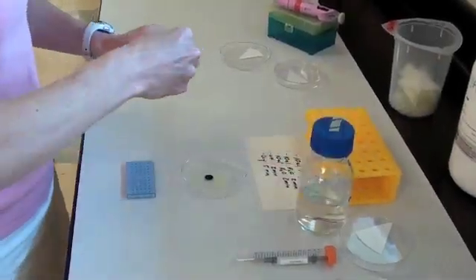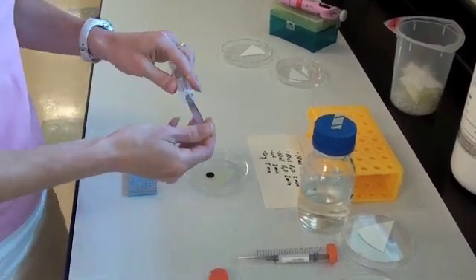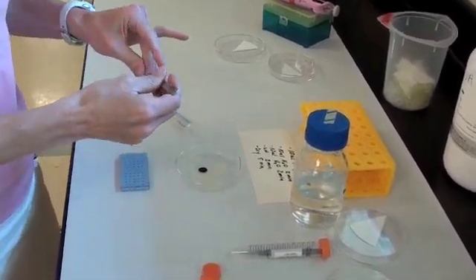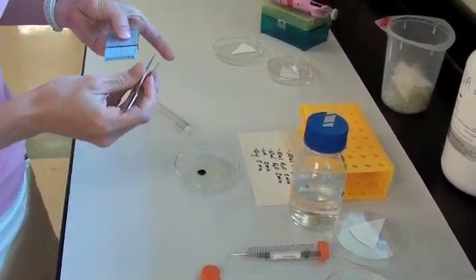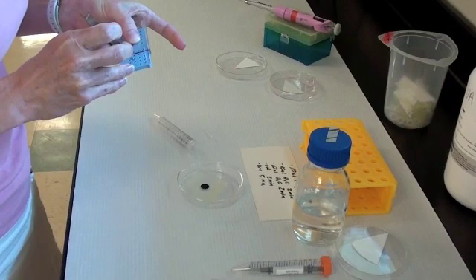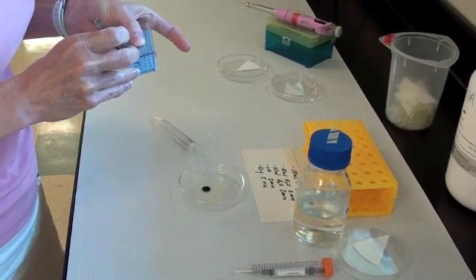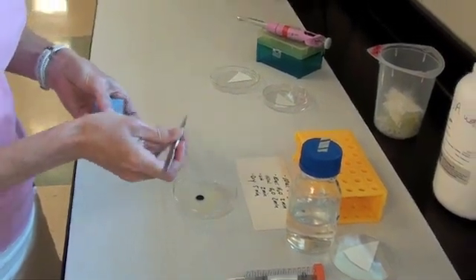When you arrive to lab, your station will look something like this. Here we'll watch as your instructor sets a TEM grid on the sticky black PELCO dot in the Petri dish. The forceps used in this work are specific for TEM work. They're very fine-tipped, and you can see that they're handled carefully and kept in containers.